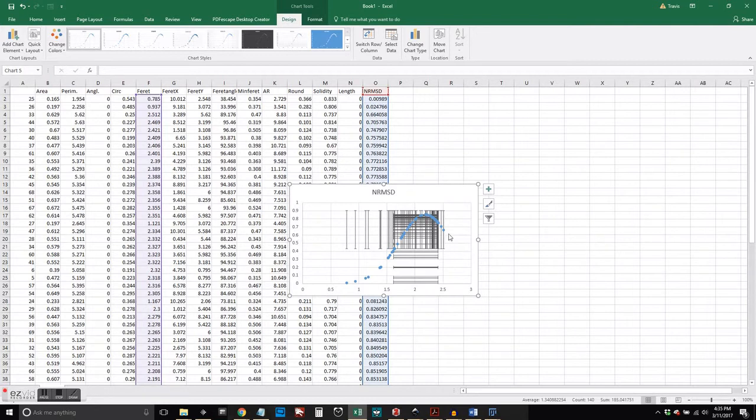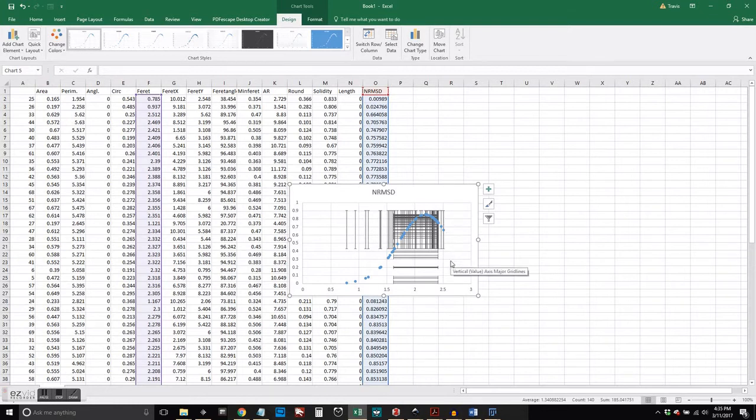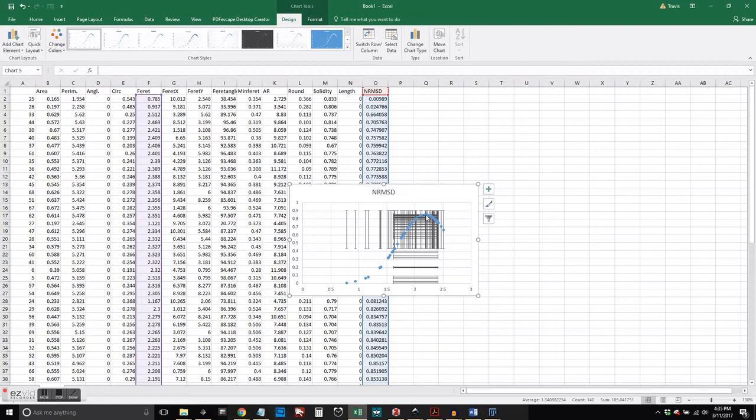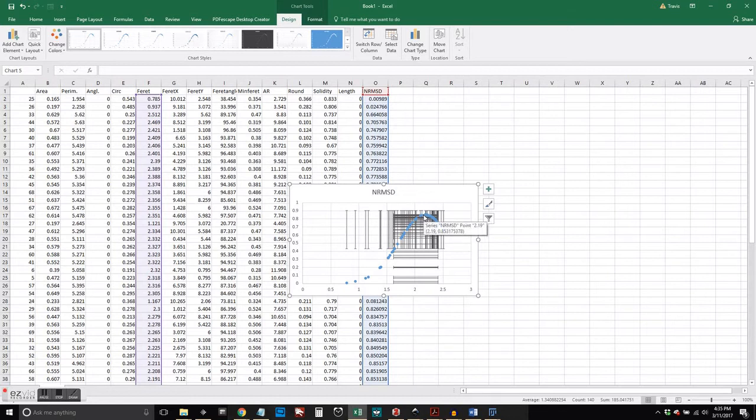And the standard deviation here is telling us that most of the data, or most of the nails, are going to be a little over 1.5 inches and a little under 2.5 inches, according to this data.